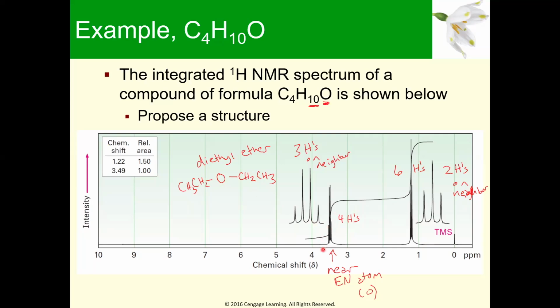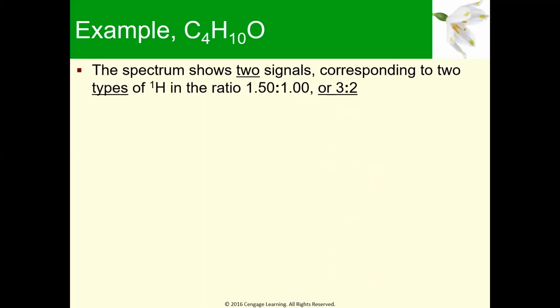So that's the thought process that you go through to use an NMR to come up with the structure. If you do move on to organic 2, then you'll do a lot more of this. The purpose today is just to introduce you to this particular skill set that you need to develop in organic 2. So, things we already talked about, let's just start filling in blanks.